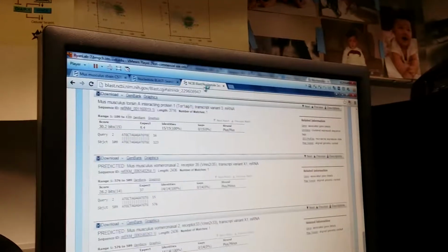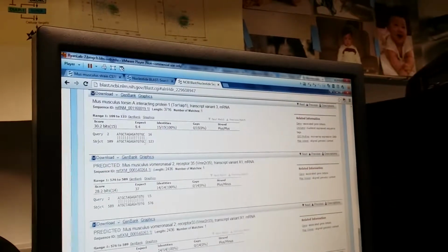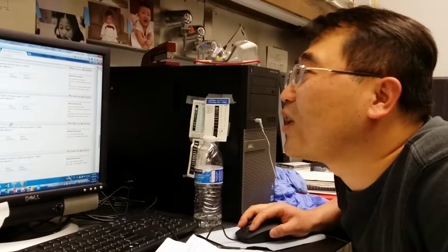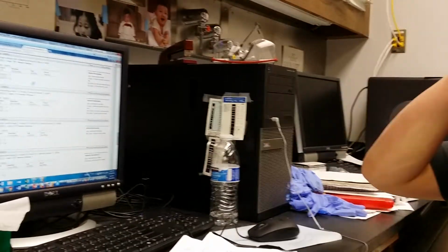You mean there's no perfect match though? No, there's no perfect match to the gene. That's not so bad. That's good enough, since Mark 1 is pretty unique for this one. Oh, well, that's all right. I see, it probably can still target this side. That's a problem, totally different.